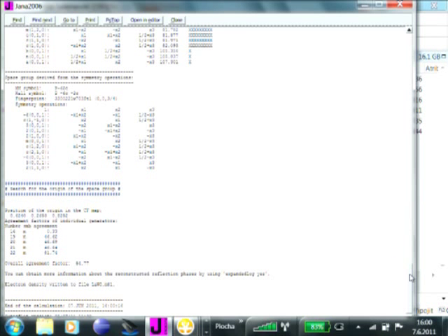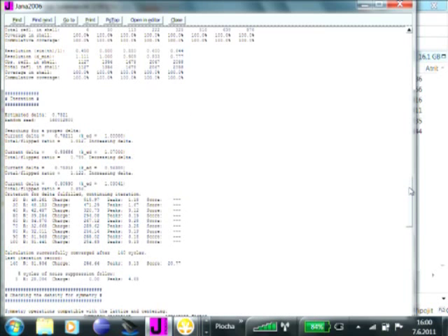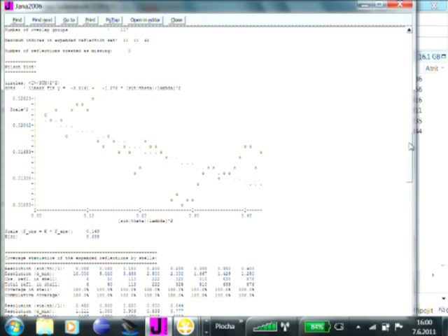No, not quite. I would like to spend a few minutes on the log file of Superflip to show you some of the most important information that you can see there. So you can see a Wilson plot. From powders, the Wilson plot is not always very reliable, but this is a nice straight line. Of course, these scattered points are the Wilson plot values calculated from the data, and the small dots are the linear fit. So this is an indication that you have at least somehow reasonable data.